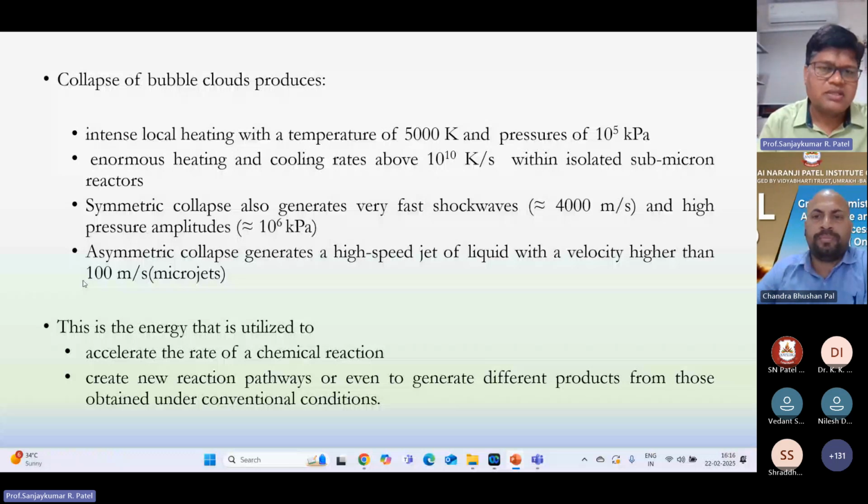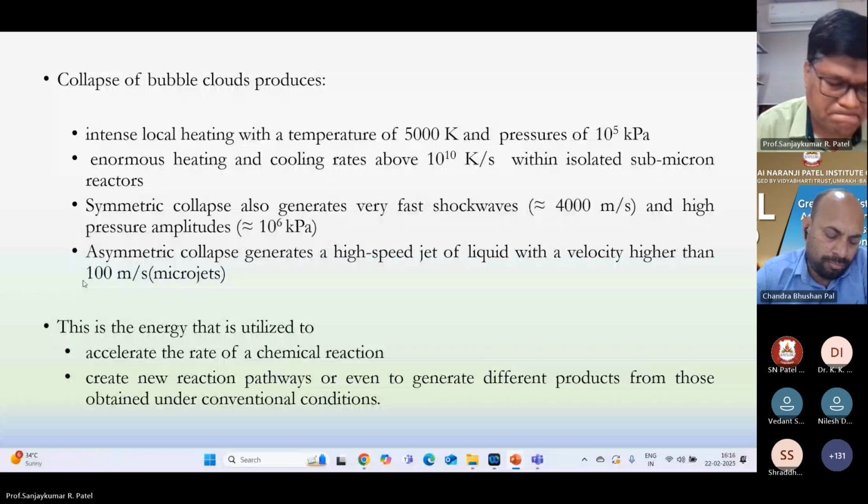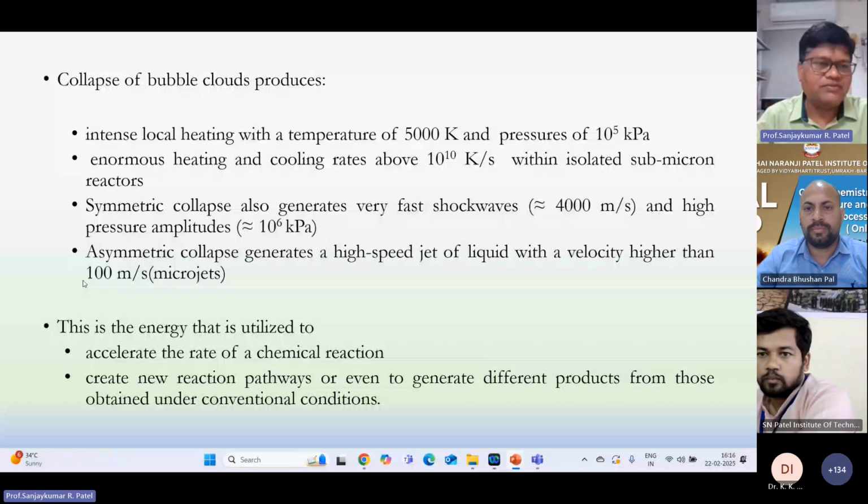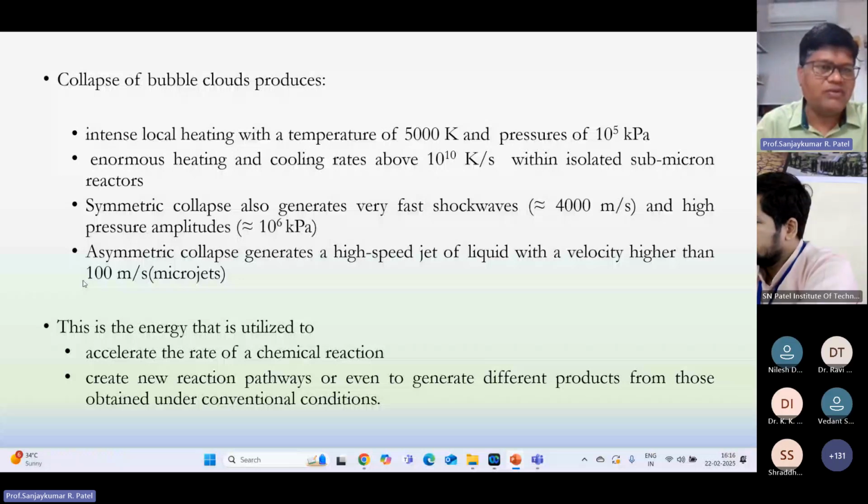So this is energy which needs to be utilized for the crystallization process. Okay, so how can we say that a particular induction time and metastable zone width are affected by the use of sound? It has already been proven in some literature studies. To give a proper idea, I have taken one example of this, which is an already proven value.